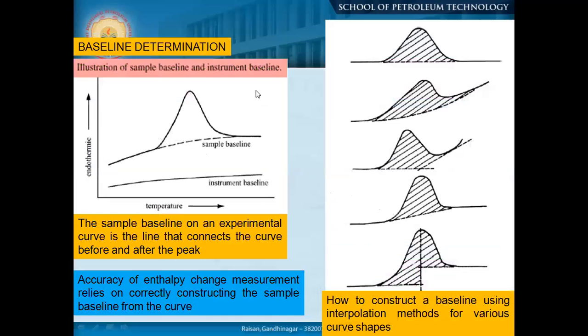Now, so many problems are involved when we are gathering the information. So whenever you go for the analysis, you should be very careful and understand what system you are operating with, and how we should get proper, accurate data. Because if you don't know the instrumentation and its disadvantages or limitations, then sometimes you will land up with wrong data or a wrong curve, and you have to deal with erroneous results.